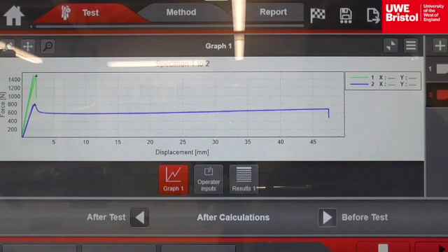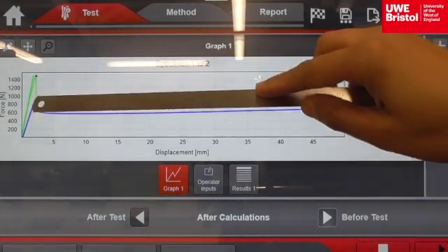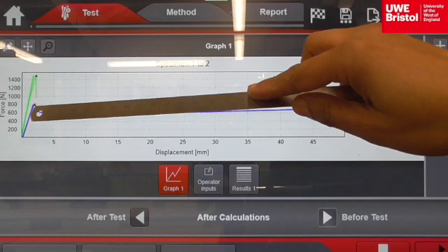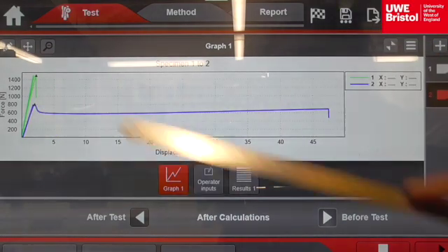The blending of the polystyrene has resulted in a lower maximum load, and noting the tensile strength is a calculation of force over area, where approximately the areas of the specimens are similar. This plot indicates this polymer will have a lower tensile strength compared to the unmodified polystyrene, which will have a higher tensile strength.